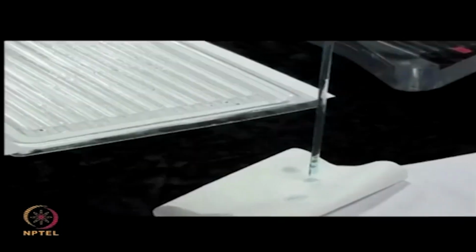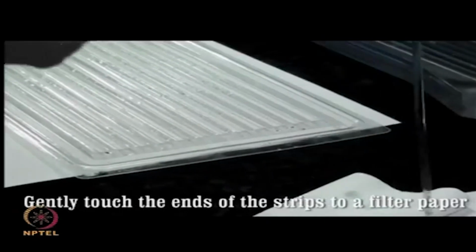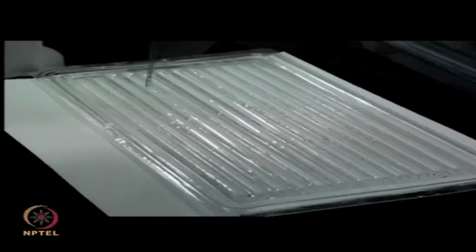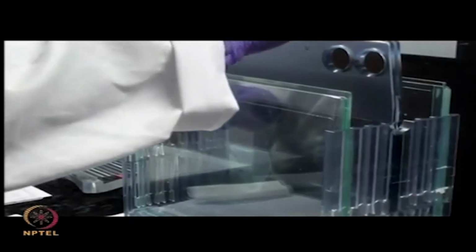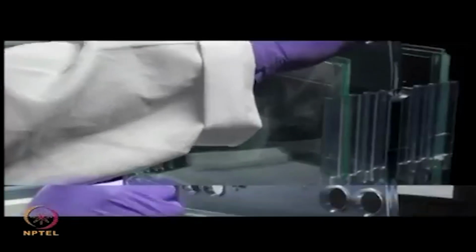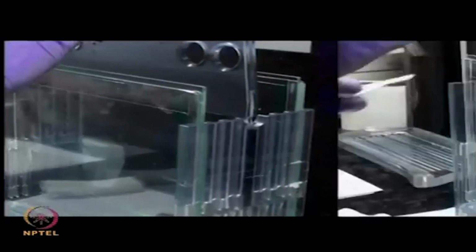SDS-PAGE. Drain out the excess liquid of the second equilibration solution from the IPG strip using a tissue paper. Soak the strip for a few minutes in the same buffer solution that is to be used in the gel tank. Then carefully place the strip in between the glass plates and gently push it in until it rests firmly on the gel surface without any gaps.